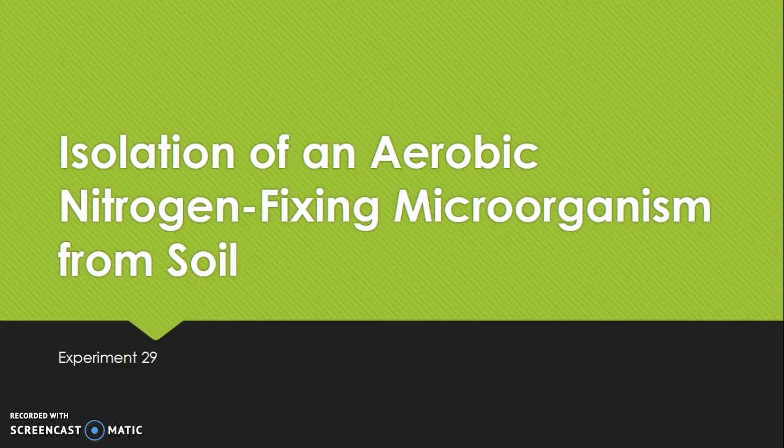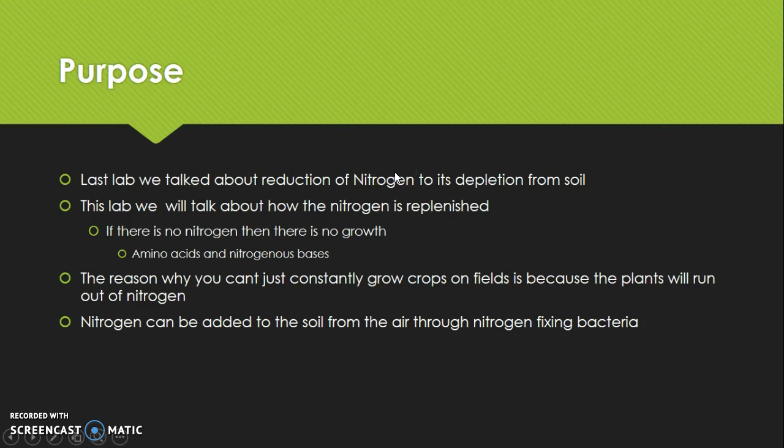Okay. So we've got isolation of an aerobic nitrogen fixing microorganism from soil. So, nitrogen fixing. Now the background's green. I don't really know why people associate green with nitrogen, but they do nonetheless. Okay.